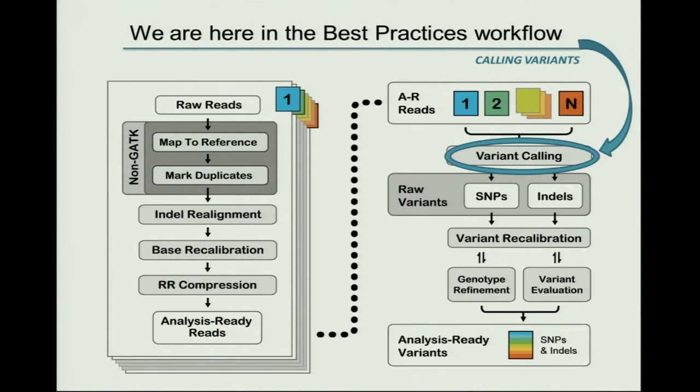There is, of course, also the case of structural variation, which is not covered, but I think that we're going to have a breakout session on GenomeSTRiP later in the day to describe how to leverage this to also discover structural variants. But that's not part of the focus in this session.